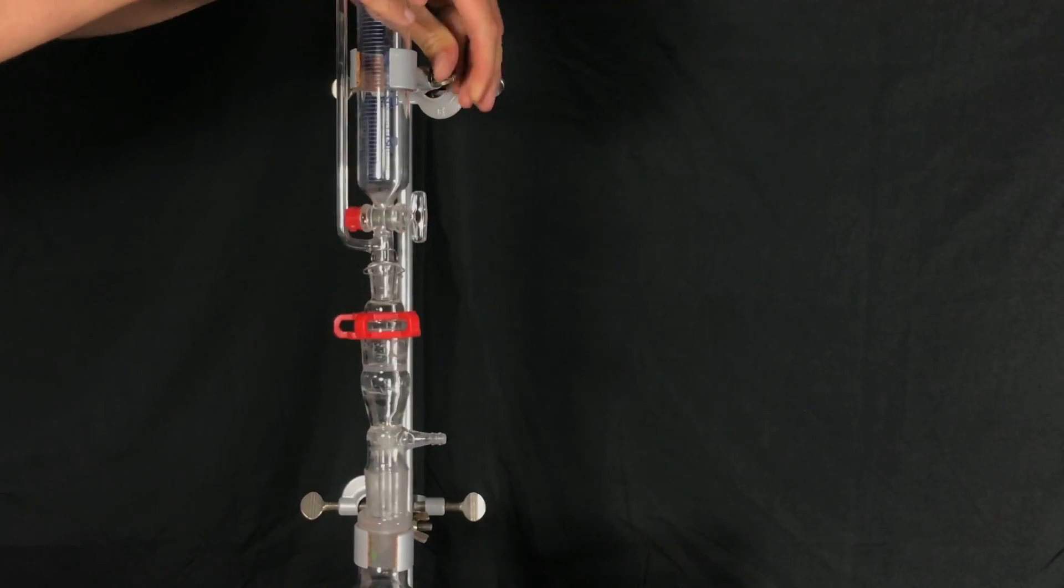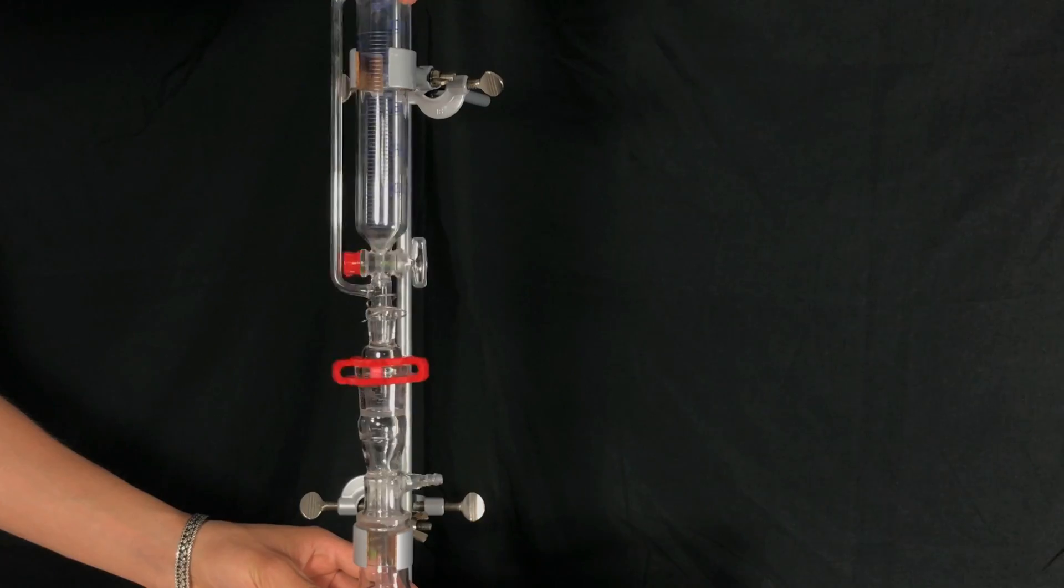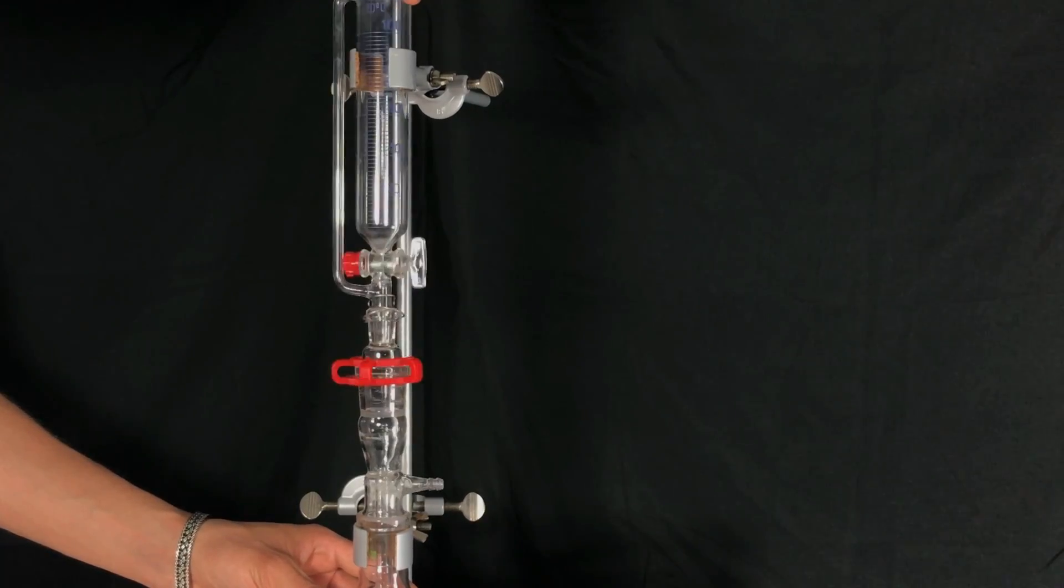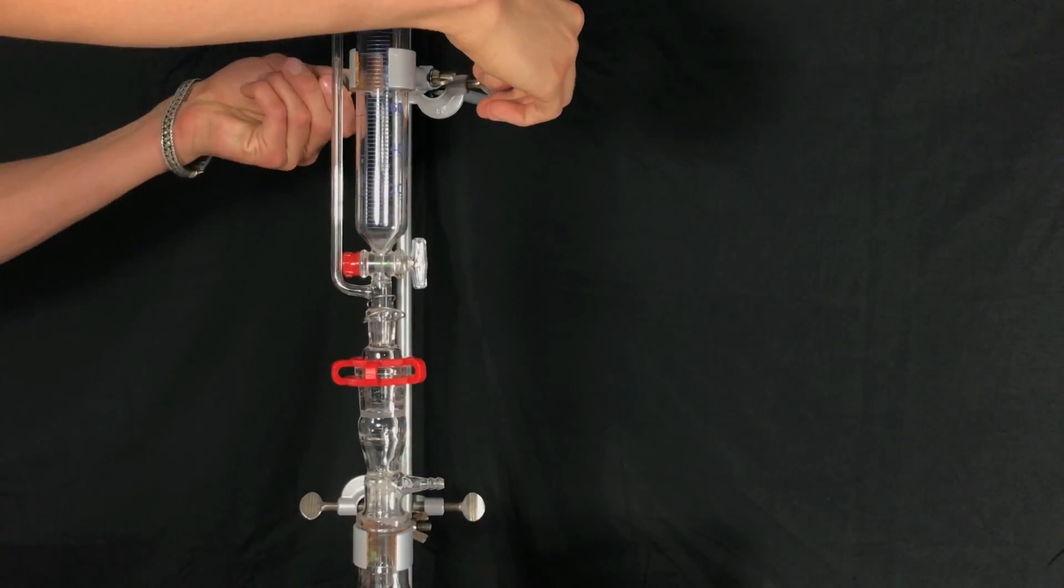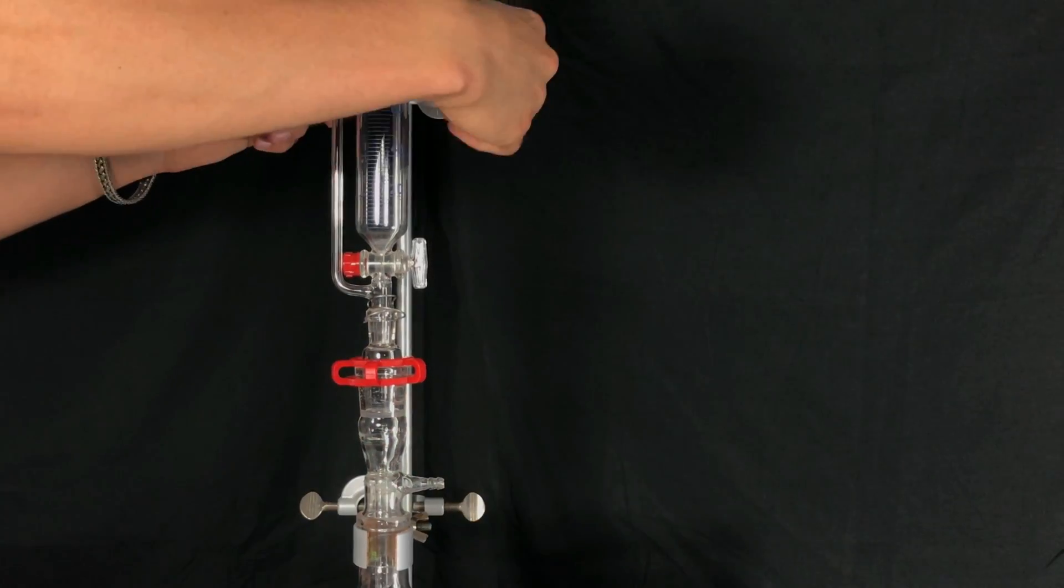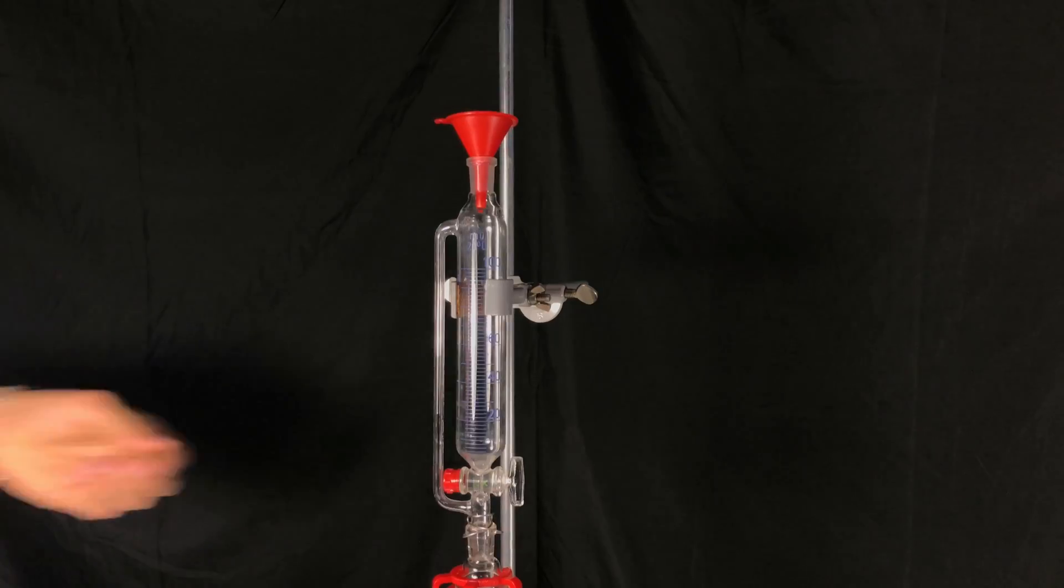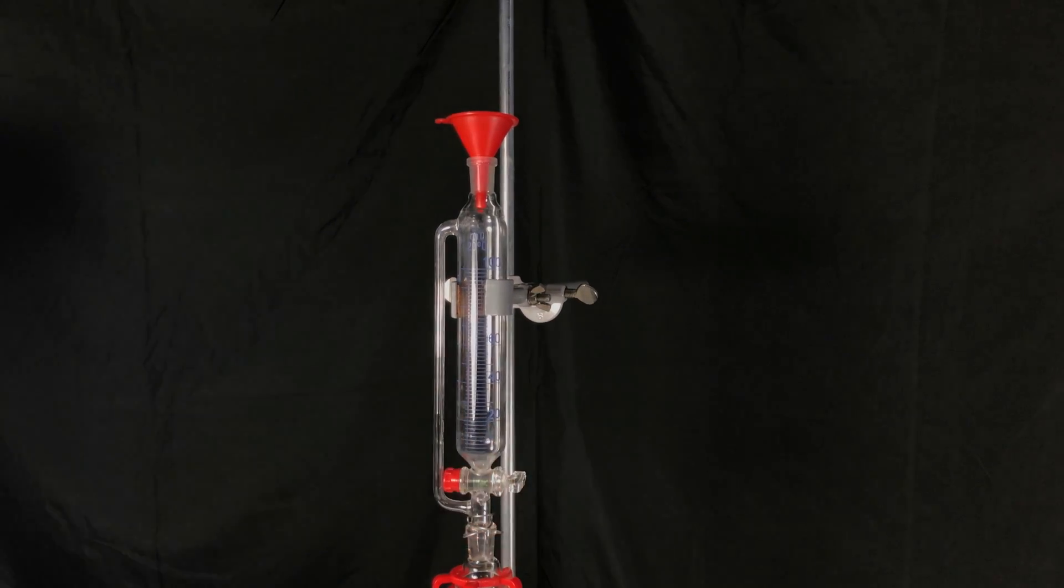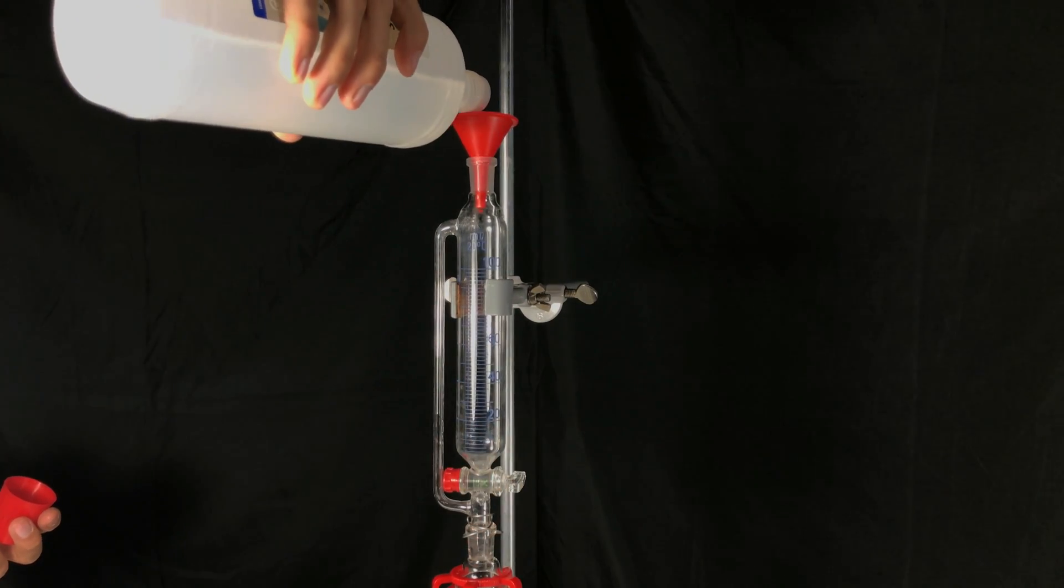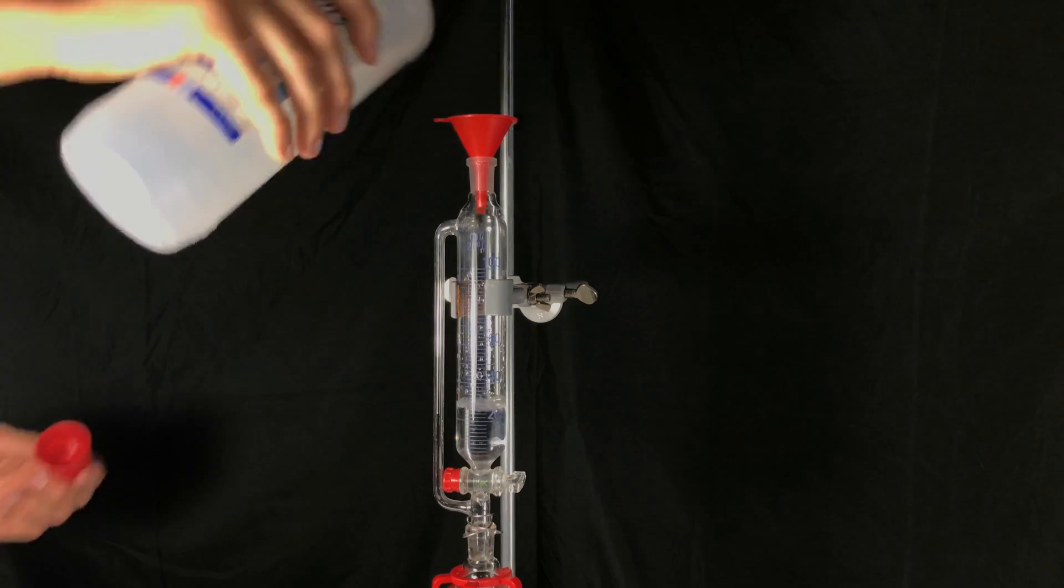An addition funnel was then lowered onto our round bottom flask. After that we prepare some dilute hydrochloric acid by first adding distilled water to our addition funnel.